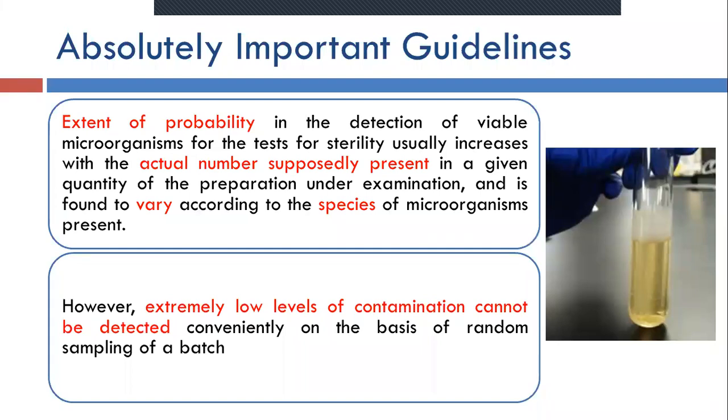However, an extremely low level of contamination cannot be detected. As I told you, it's very difficult. In 100 liters, suppose we expect that there may be some 10 viable bacteria still remaining in the product. What is the probability of finding those microorganisms? It is very, very less.